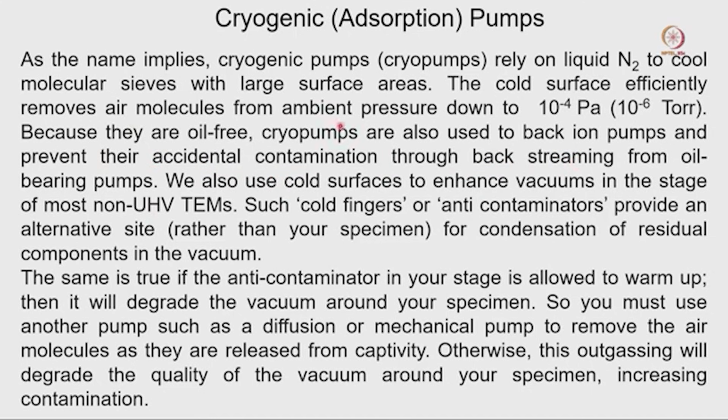So, we are not going into these technical details. Always remember that we are also using some kind of cryogenic pump, where we use liquid nitrogen to trap the water molecules and ions to remove those kinds of contamination.